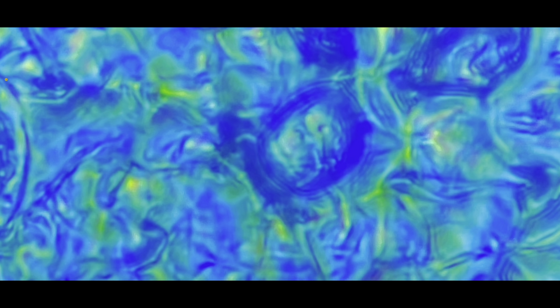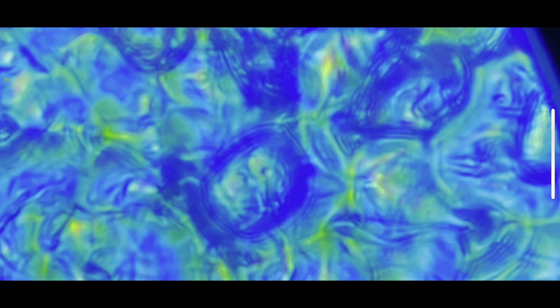Can we see telophase? Let's add a mitosis tutorial to this video. It's amazing how some of these cells look so soft and round, yet others are kind of nut-shaped and have these super thick linings around them.